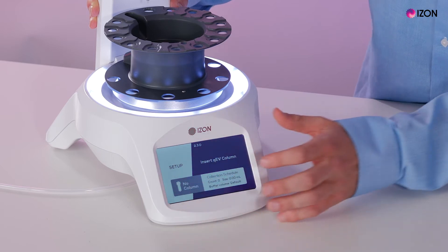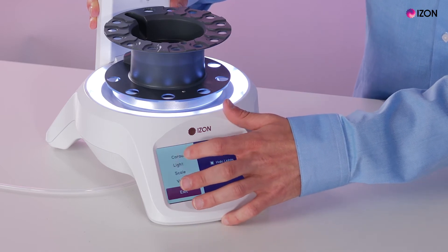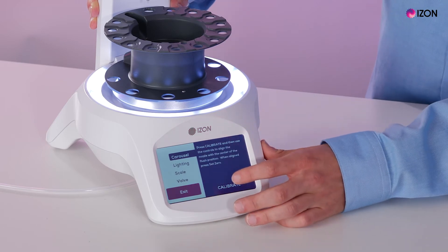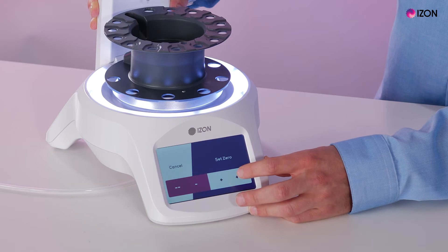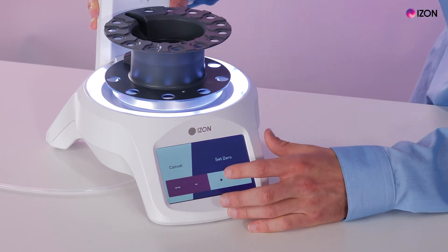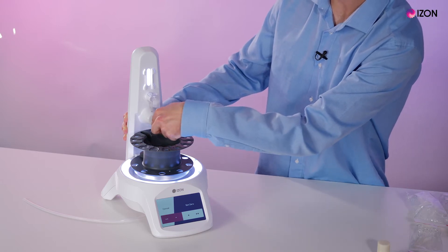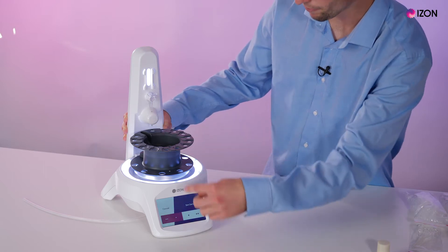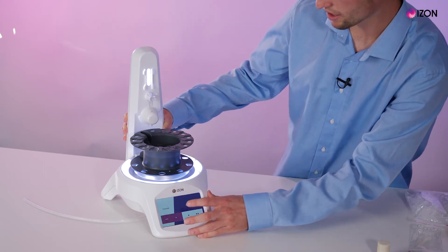To set up the AFC we go into the setup menu by pressing setup. We can click on the carousel and when we calibrate we have four options to go clockwise or anti-clockwise. What we want to do is line up the AFC so that the void flush hole is in line with the tube adapter. Once we are happy with where zero is, we set zero.